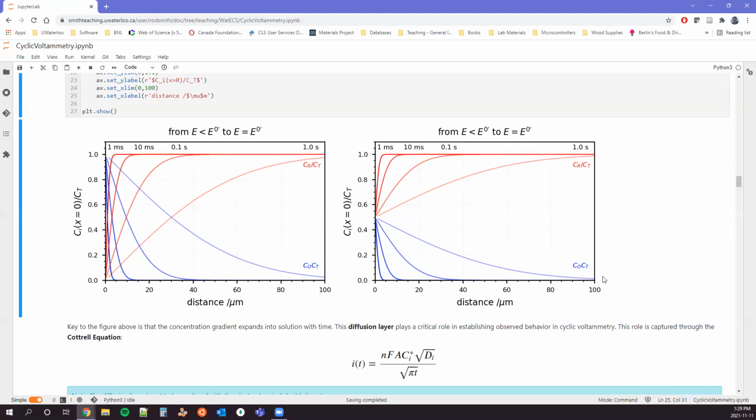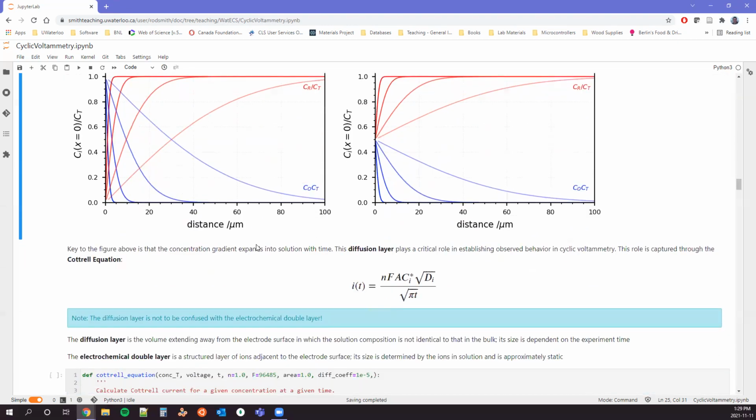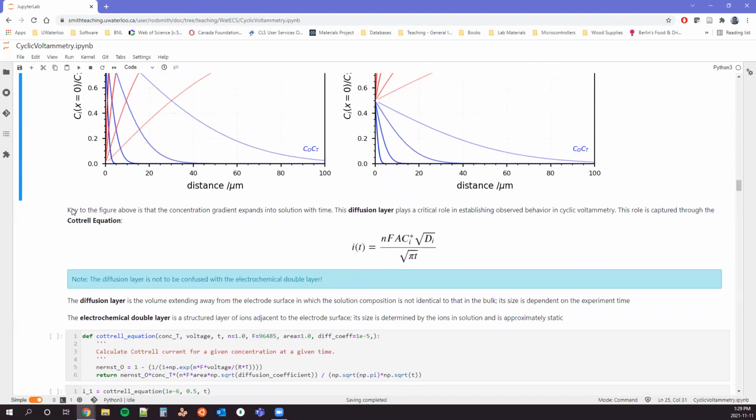And it's the opposite for that oxidized species, right? And so this is of course going to affect the current that we see because it's changing the effective concentration at the electrode surface at any given time. And so this is very important to the behavior that we observe. And so this was all worked out decades ago. And so this diffusion layer is kind of embodied in our data that we'll see via the Cottrell equation.